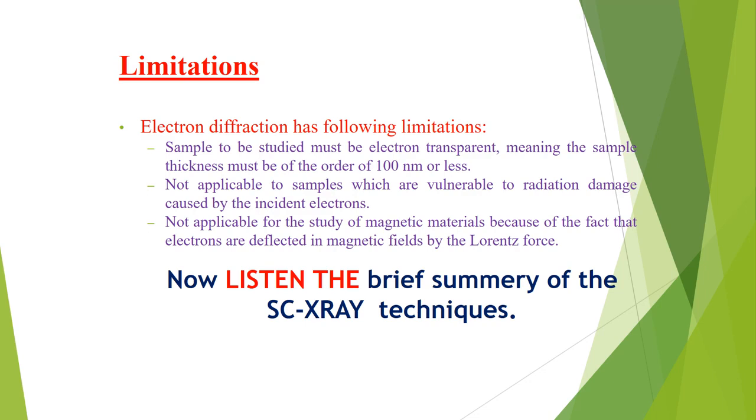The diffraction condition is met at a point in 3D reciprocal space. A smaller amount is needed for sample analysis, that is 1 to 10 milligrams versus 500 to 5000 milligrams in other techniques.